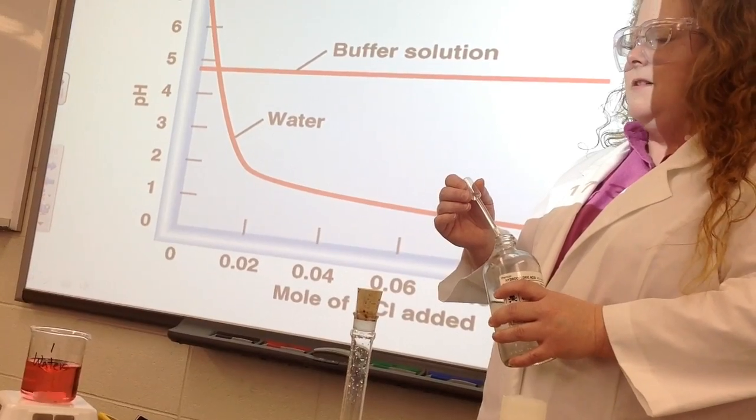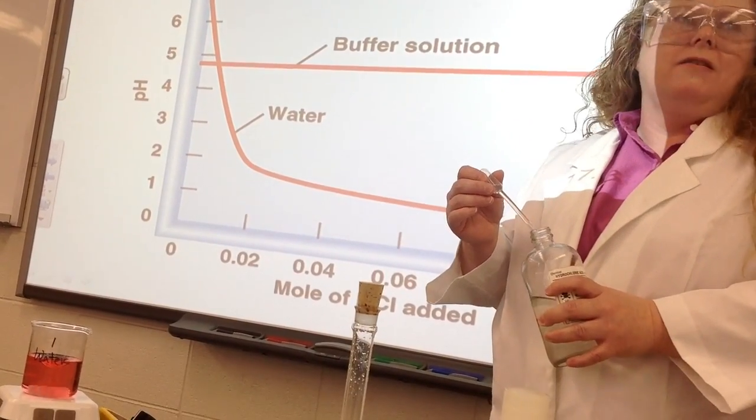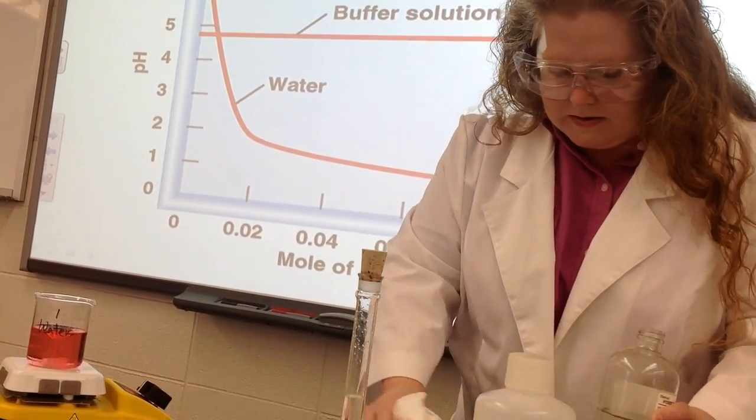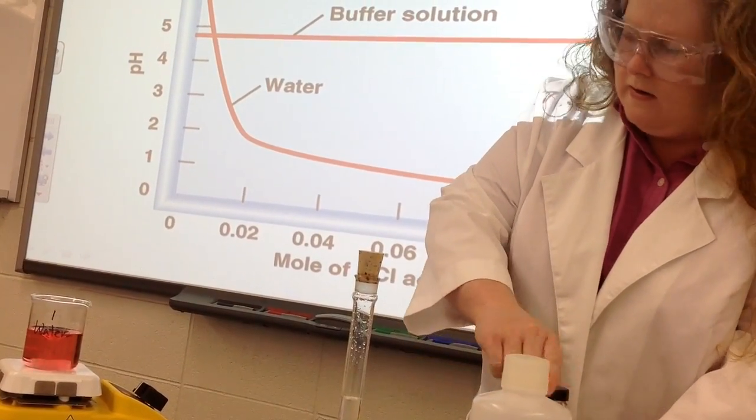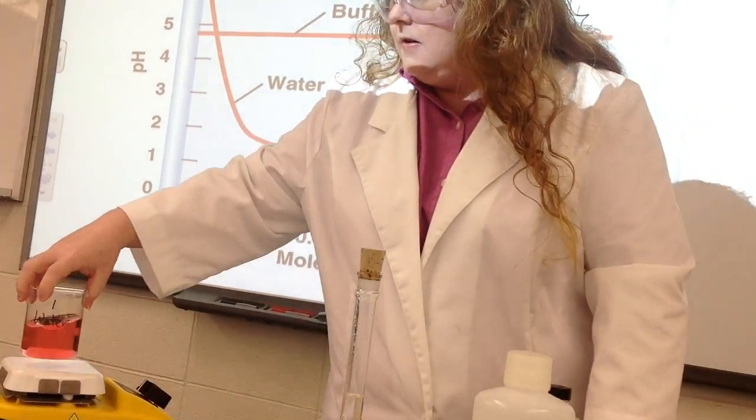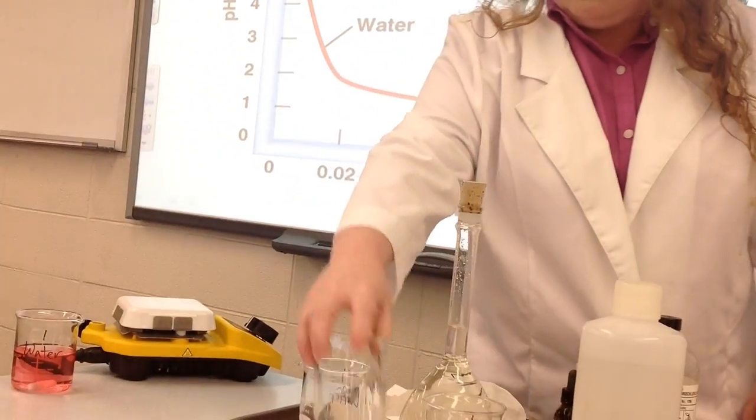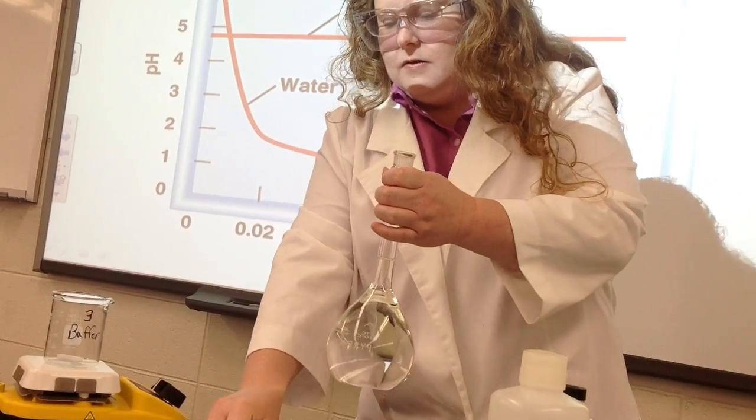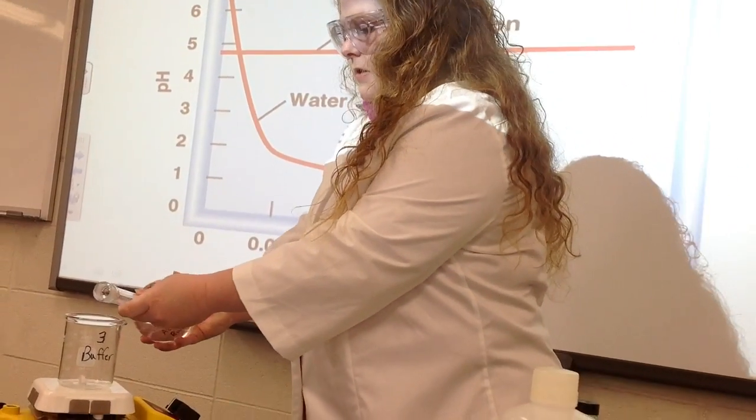Okay, now let's see what would happen if I do the same thing. This is water, I'm going to put some buffer in this beaker and I'm going to add some of that.